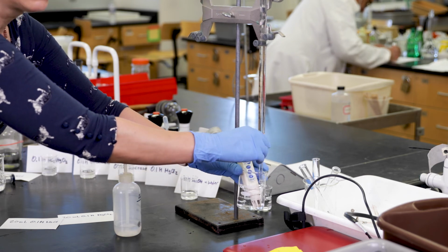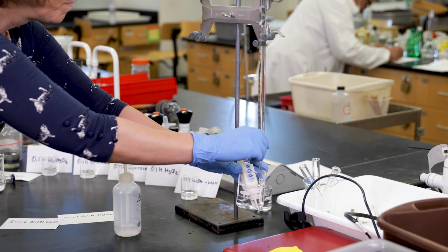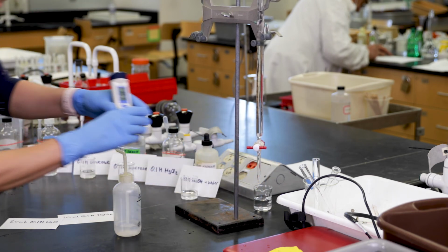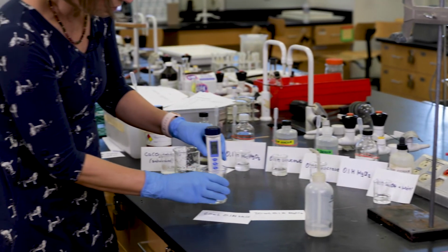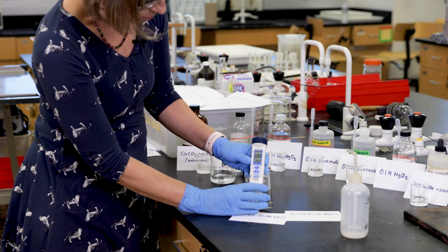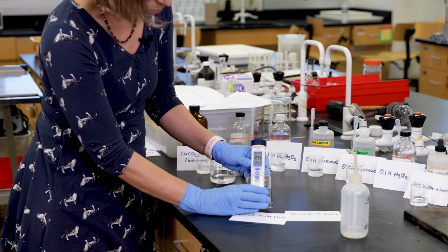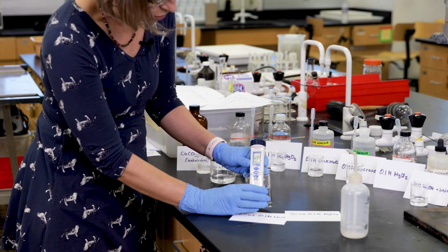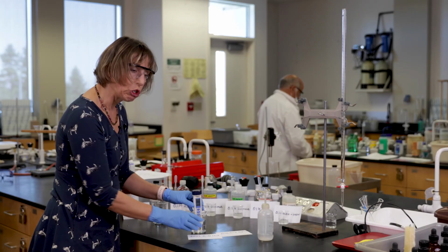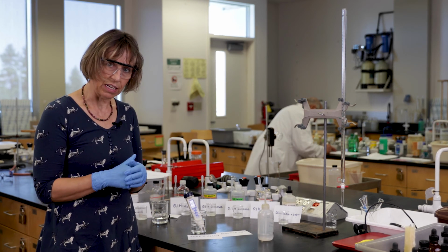And the last addition to a complete volume of 80 milliliters of water. So after this addition, we have added exactly 80 milliliters of water. Last measurement, let's see what it does. Let's stir that a little bit. And the measurement after addition of 80 milliliters of water is 1,298 microsiemens. So these data points you want to add into part 3, the data report.